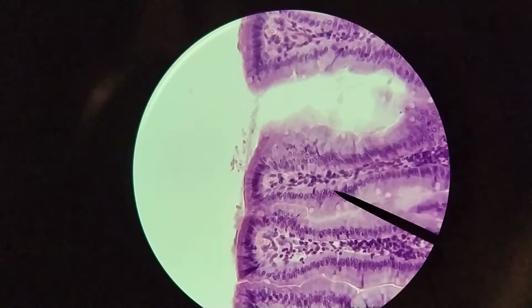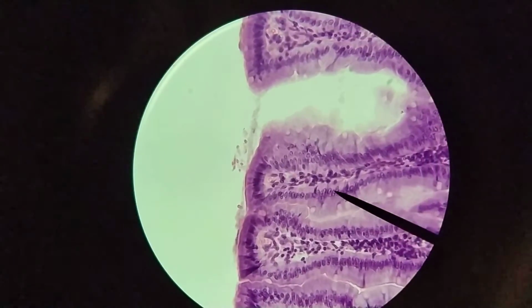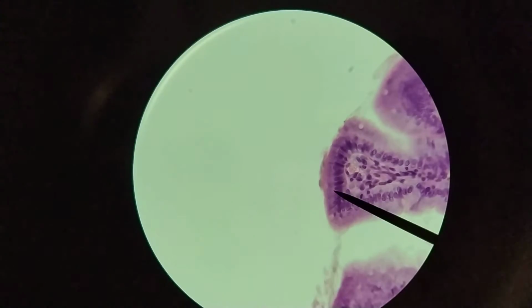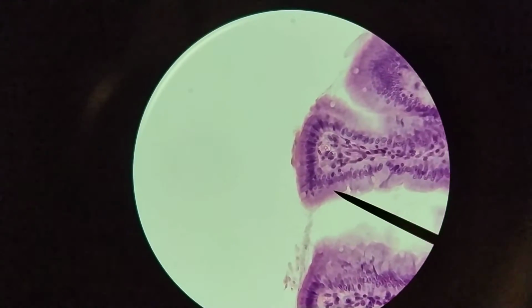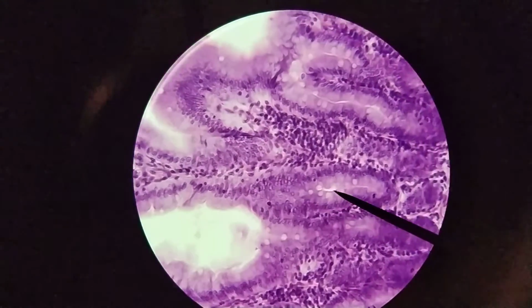So every about 7 days or so, you have new cells being produced and replacing cells that are being lost at the surface. So cells up here at the tip of the villi tend to be removed every 7 days or so. They are lost, kind of fall away into the lumen, and they are replaced by the cells that are kind of just migrating across this epithelium, slowly moving along. And so the cells will kind of take over for them at the tip, and those cells are coming in from these crypts of Lieberkühn.